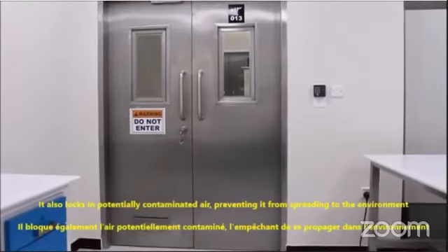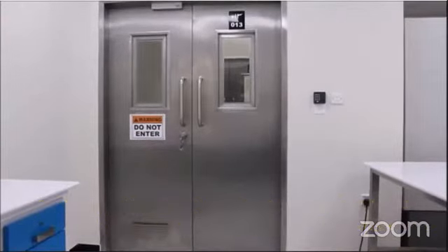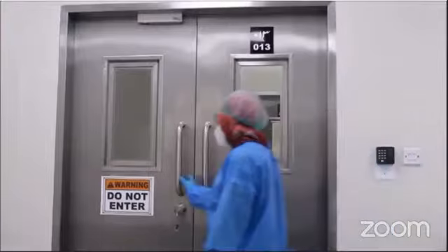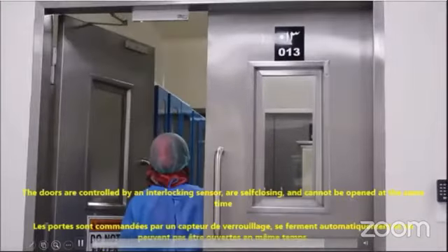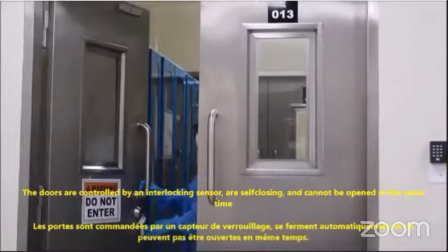The interlock system includes the outer door that opens into the anteroom and then the BSL-3 facility. The doors are controlled by interlocking sensors and the pin code. These doors are self-closing and cannot be opened at the same time.